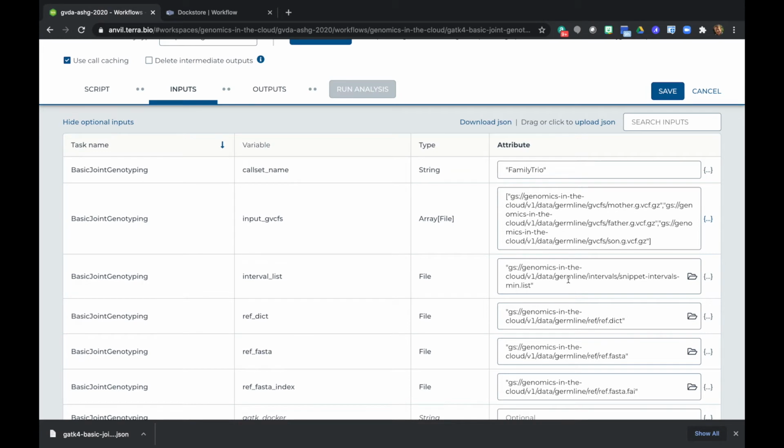The data that you imported was generated using a version of the human genome reference that is called GRCH38, or HG38 for short, for human genome. That's different from what we used in the plumbing test, which was an artificially small data set. Now we're working with a real full-scale genome, so you have to find a copy of that build of the full genome reference. Fortunately, Terra workspaces can access preloaded resources that include HG38 references. So I'll show you how to use them.